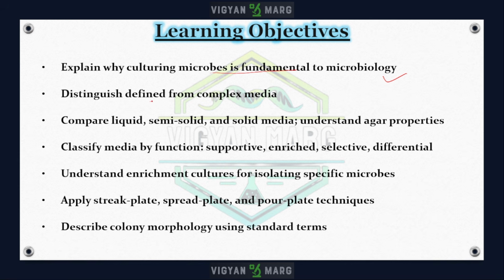Distinguish defined media and complex media and understand when each is used. Compare liquid, semi-liquid, semi-solid, and solid media, and understand why agar is such a powerful solidifying agent. Classify media functions like supportive, enriched, and selective and differential media. Understand enrichment culture.